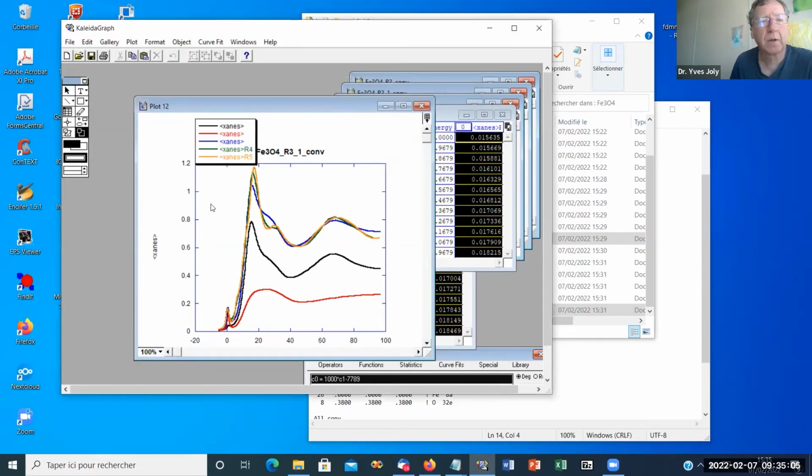Okay, so you can see that it's rather different. So it's easy to see that radius 3 was not sufficient. And if you would compare to experiment, you could see that this bump is indeed here. Between 4 and 5, there is not so much difference, but there is some. So also a shoulder is appearing here. It's also in the experiment.